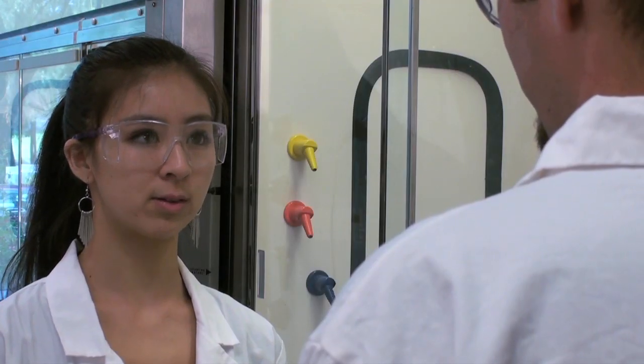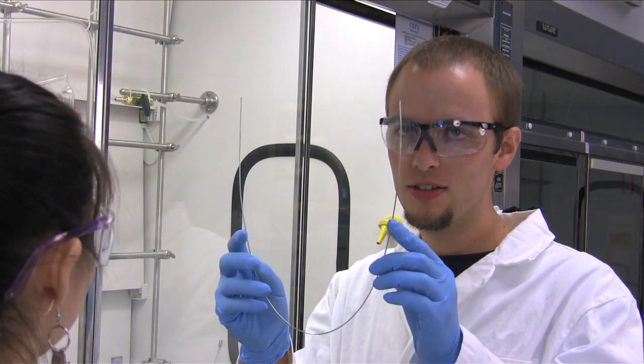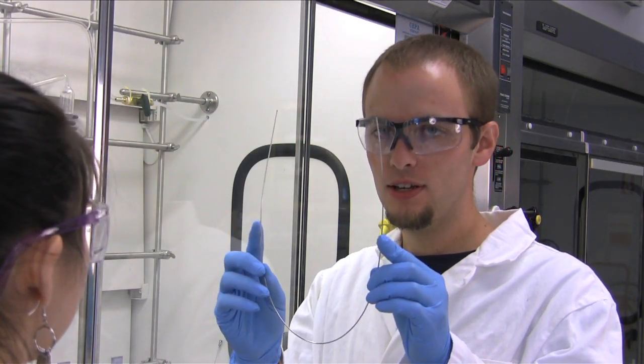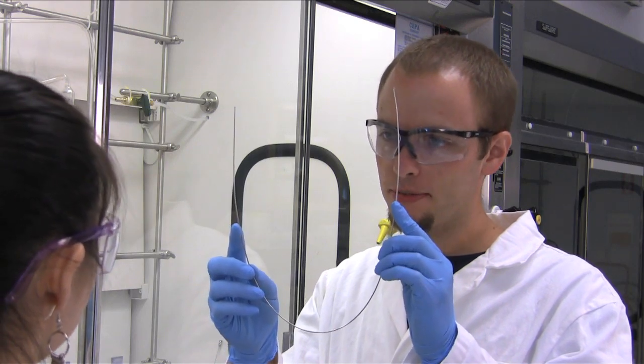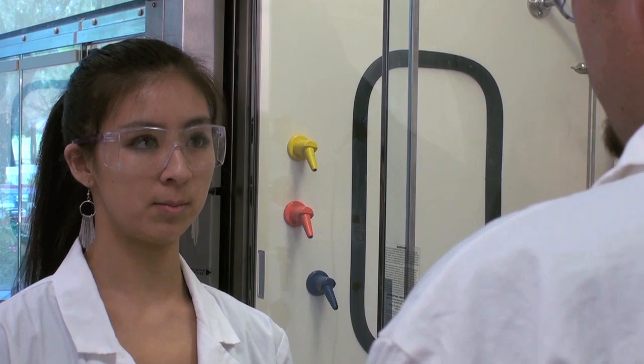What about for larger amounts? For larger amounts, we use a cannula. What's a cannula? A cannula is a stainless steel tube with a needle-like end on one side and a blunt end on the other. I see, the needle allows you to insert the cannula through the septum. What's the blunt end for? The blunt end allows you to reach the bottom of the flask to draw the last of the liquid off.